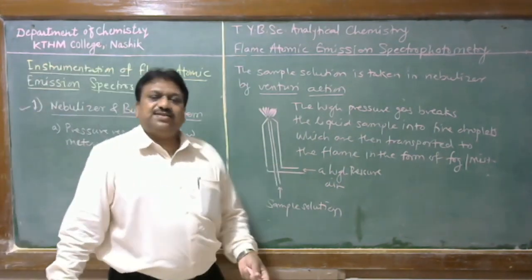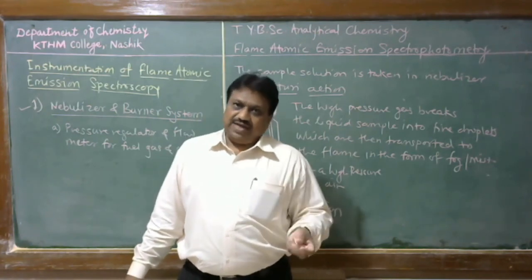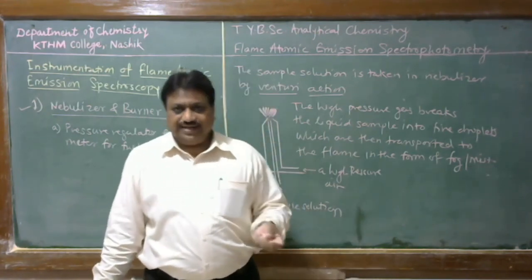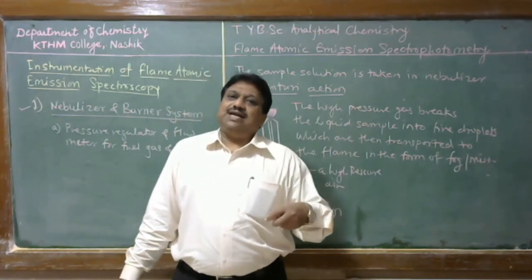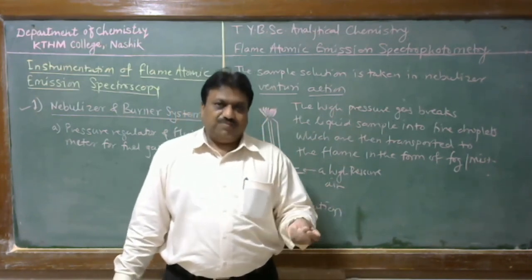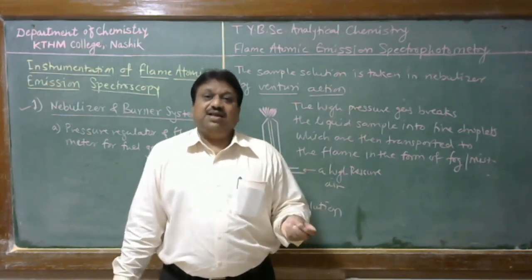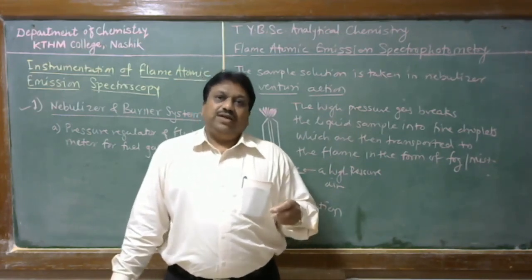When these droplets or mist are given into the flame, the solvent is vaporized, then it is converted to a solid residue. After that, the solid residue is converted into gas form. The gas is decomposed to gaseous atoms, and then the atoms undergo excitation.